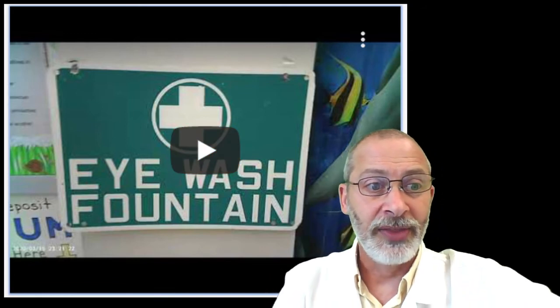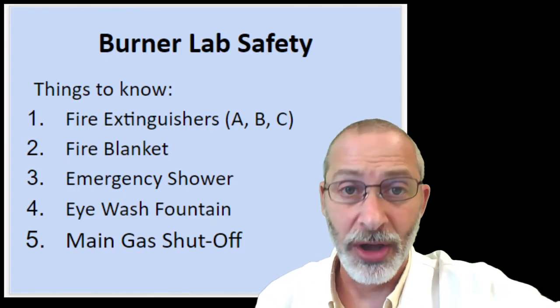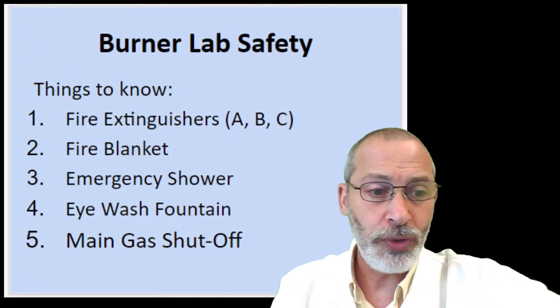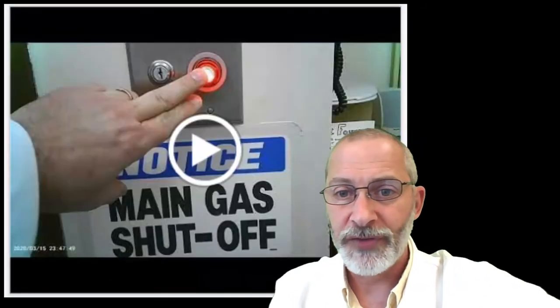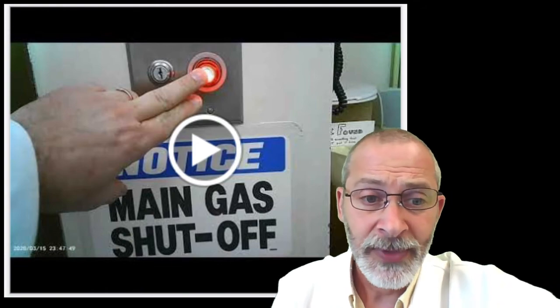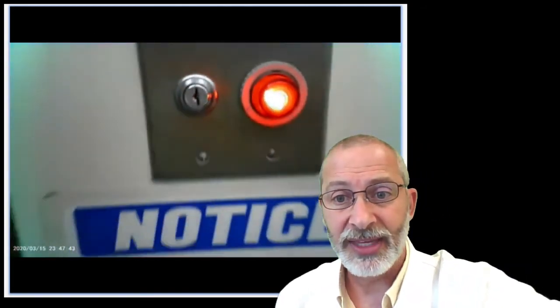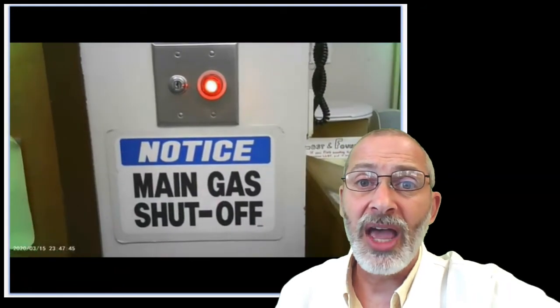The next thing that you need to be aware of is the main gas shutoff. There are two main gas shutoffs, one in the front and one in the back of the lab, and they look like this. And whenever we use the Bunsen burners, it will require me with a key to activate the gas. When that red light is on, you know the gas is on.